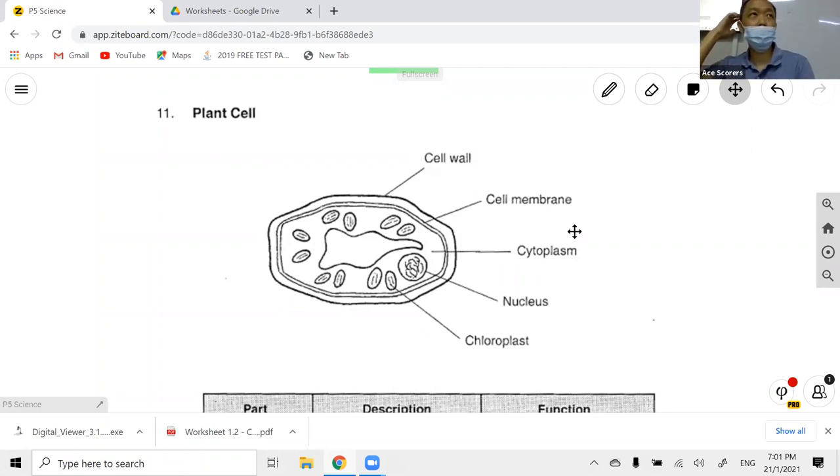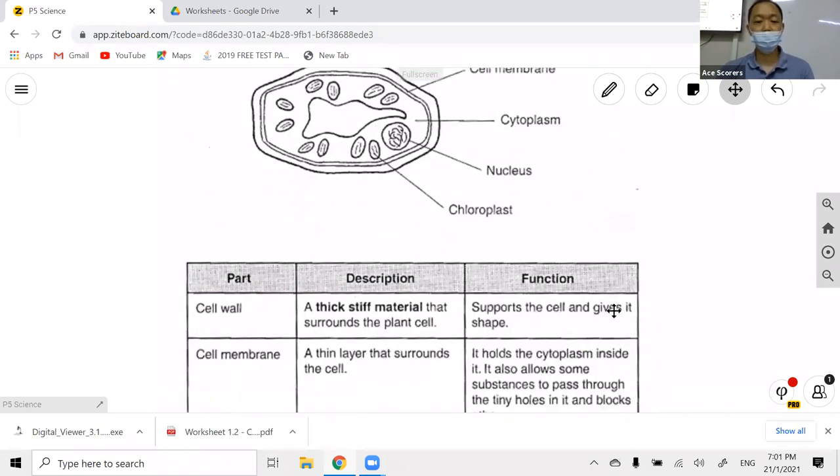So next week maybe we can try to find a leaf or plant, right? And then we will try to see the cell wall. We will not be able to see the cell wall, but we can see the structure of how a leaf looks under a 1,000 times microscope. Whenever you all bring a leaf, we can always bring it out to see.